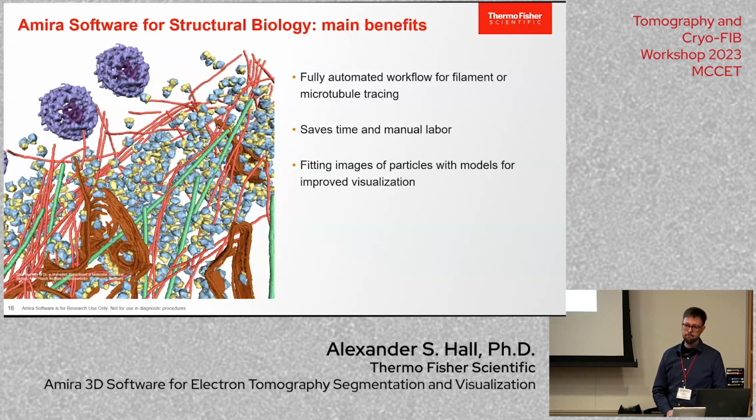But oftentimes with Cryo-ET, we're delving into the unknown. No one's ever looked at this sample before in this way. So it's a hard problem to solve. I'm not really sure how to say it other than the only way you can be 100% sure is with some kind of simulation of data and perfect ground truth to compare against.